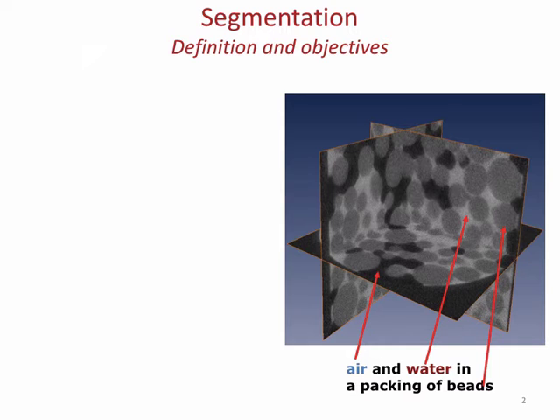So I might have these disconnected objects for various reasons. It can be finite resolution issues, it could be simply noise, but I misidentified one phase as the other. So in any event, more likely than not, you will have to remove some of the objects that you have because of the misidentification, or because you don't want them to cause trouble in whatever you are doing later.